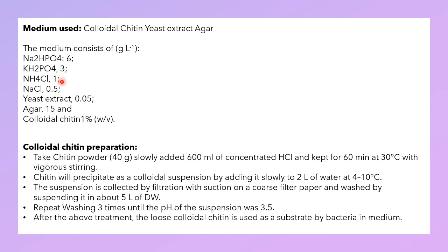Okay, so this all depends on what is available in your lab, how many ingredients you have, and what you can use, and you can explore. It is not strict that you have to use the media composition which I am specifying here. You can go with other media which are already used and tested. Go on the internet, google some good research articles, and if you want to try at least 2 to 3 different kinds of media, that is also okay.